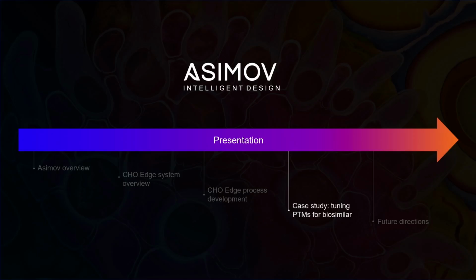And so now that I talked a little bit about the CHO Edge process development, I'm going to move to the case study that we did for tuning post-translational modifications for our biosimilar.